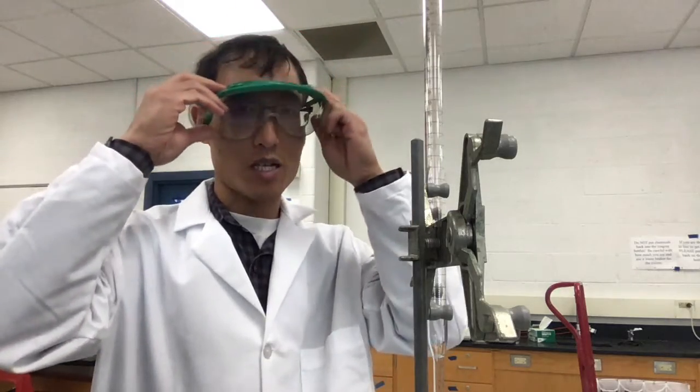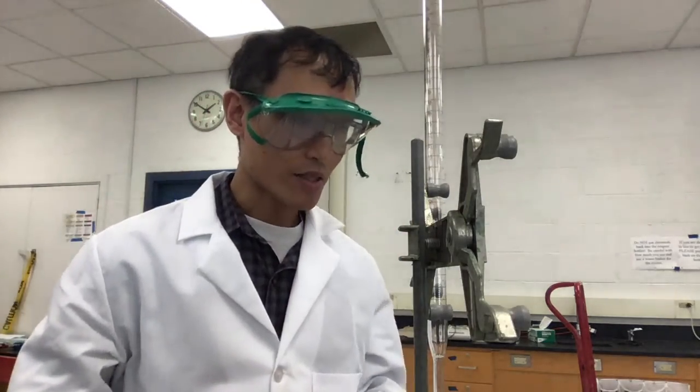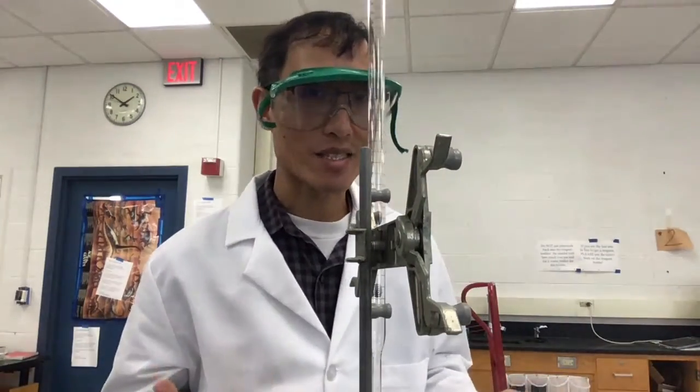So in this case, I'm gonna put my goggles on now. I'm gonna have a solution, an unknown solution of acid, hydrochloric acid. So this is my hydrochloric acid here. And we're going to measure a specific amount into a flask.